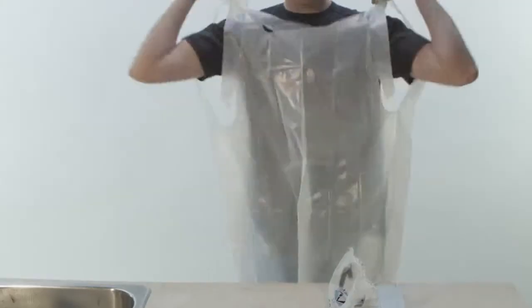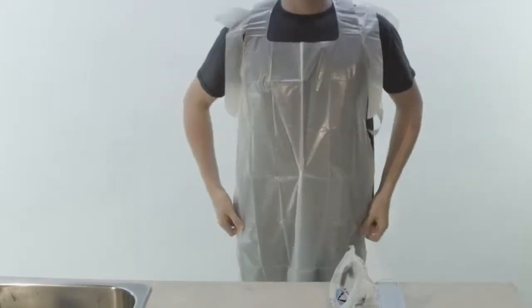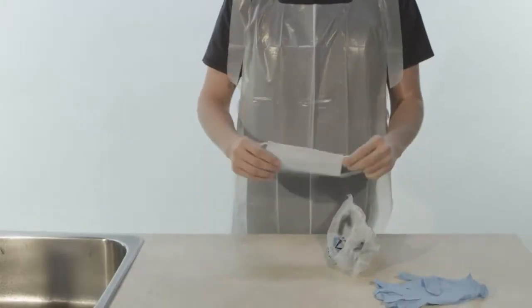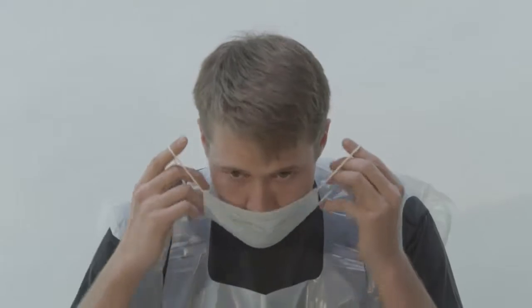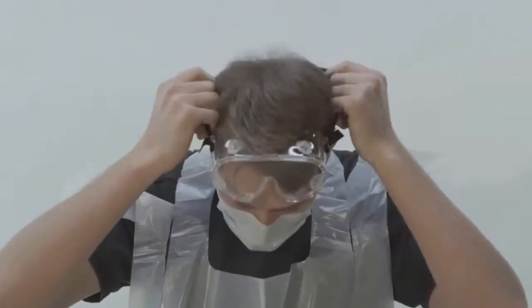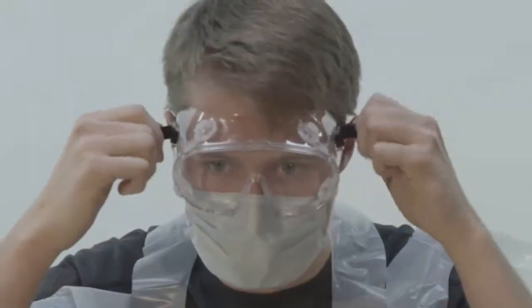Put your head and arms through their corresponding holes when equipping an apron. When putting a face mask on, put the loops behind your ears, pull the bottom portion under your chin, and form the nose piece properly on your nose. Goggles should be pulled over your hair, securely placed over your eyes, and then tightened.